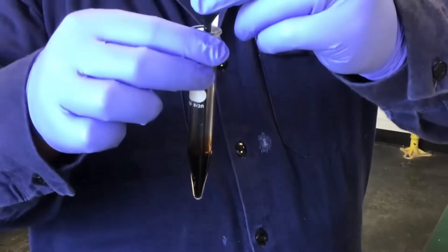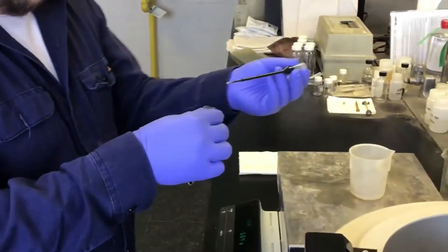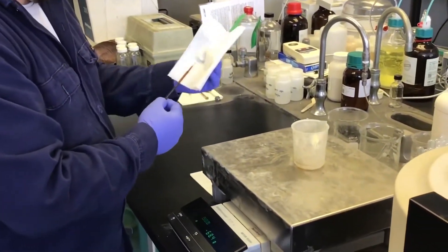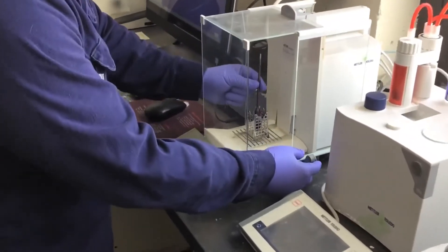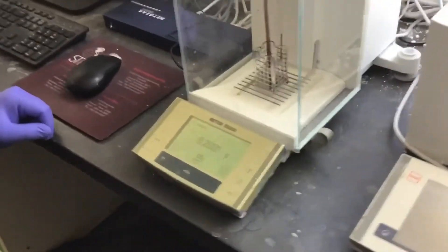Once enough acid is collected, again place positive pressure on the pipette while exiting through the hydrocarbon layer. Wipe off the outside of the disposable pipette to ensure no hydrocarbon remains — even one drop of hydrocarbon in your sample can drop the acid strength measurement by over 1%. Your sample is now ready to be titrated.